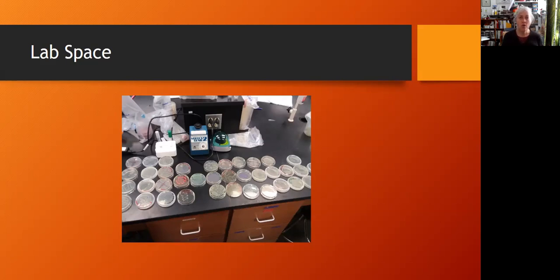It's stocked with the equipment they need to be able to work on their own, you know, freezers, refrigerators, incubators. We just got an autoclave that we put in there that's very student friendly so that they can actually autoclave their own stuff, pour their own plates. My job is lab manager here at New Mexico Tech, so you kind of need someone like me around to be able to step in if a student needs help. So I'm here most of the time, and that's a key part to being able to implement these classes.